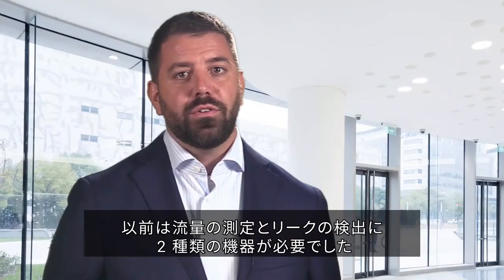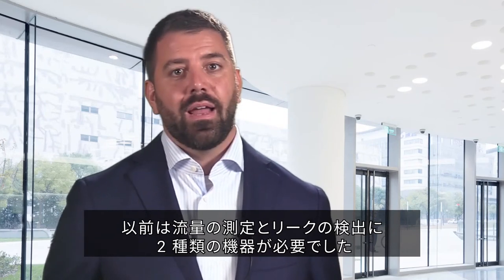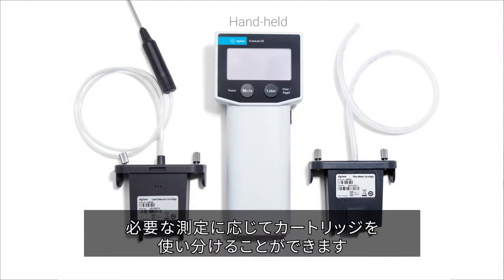Previously, a user would need two separate tools to complete flow measurements and identify leaks. Now, using the Agilent CrossLab CS, the user can have a single handheld and use a cartridge depending on the measurement needed at the time.